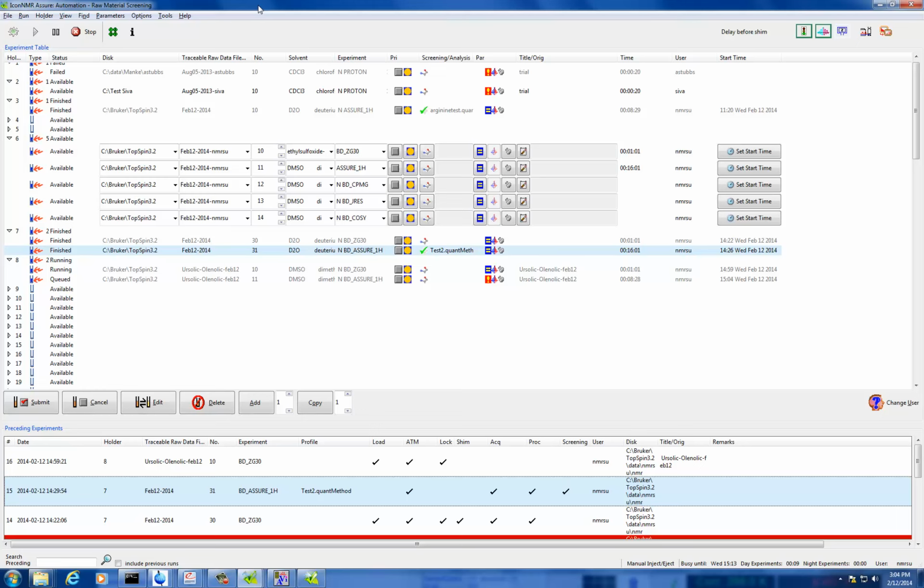You didn't specify anything. But if you make a quantification reference, you tell the method that when you quantify arginine, make this 10 millimolars. Once it runs the quantification standard, it identifies arginine and says that this area here is 10 millimolars, and it's going to save that information. That's the only difference.